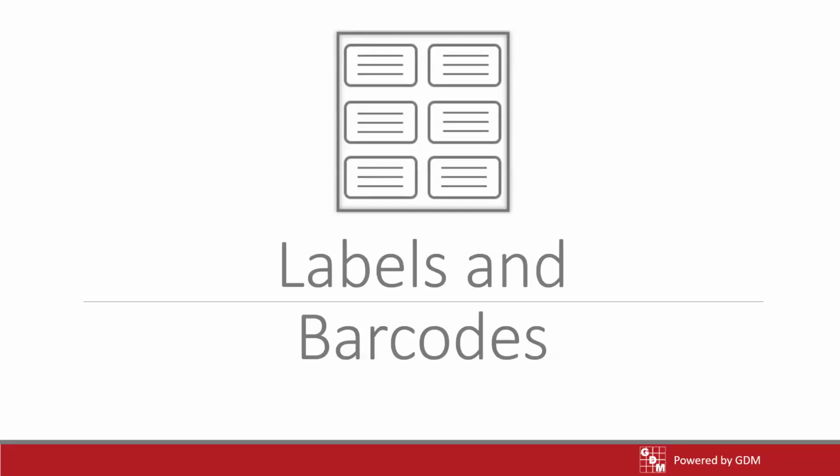So welcome today to our topic on labels and barcodes. Primarily working with labels in ARM. As I said, we'll have kind of two sections, two pieces to this. We're going to talk through the built-in pre-built labels, I guess we'll call them, in ARM that already have defined structure.